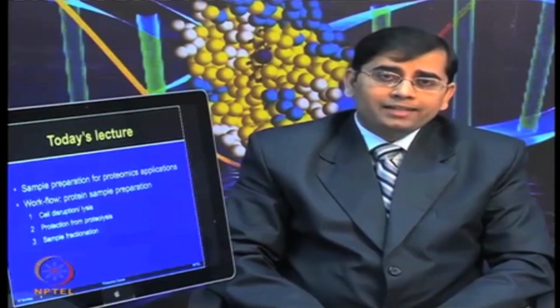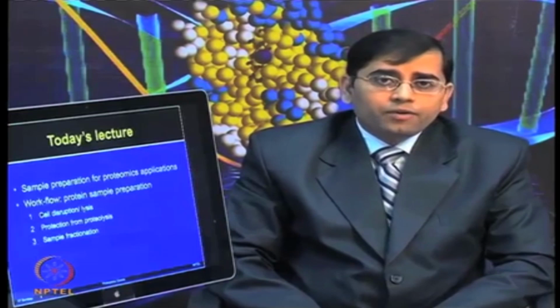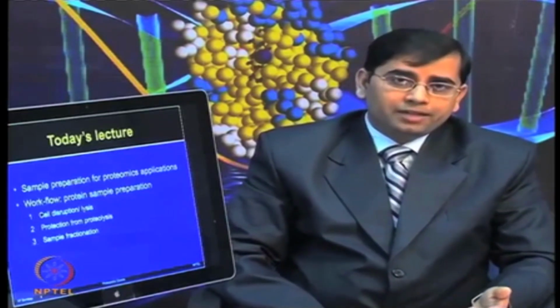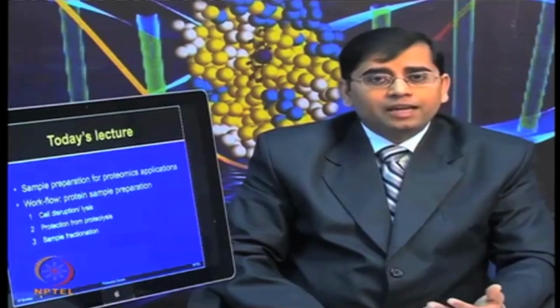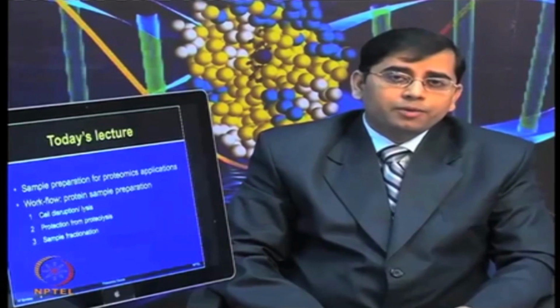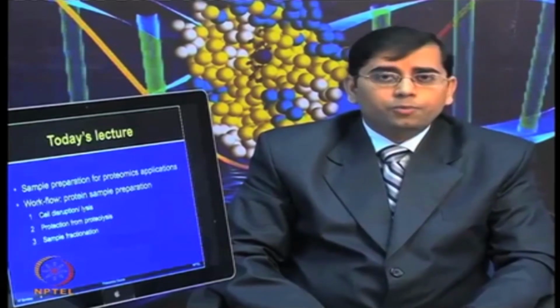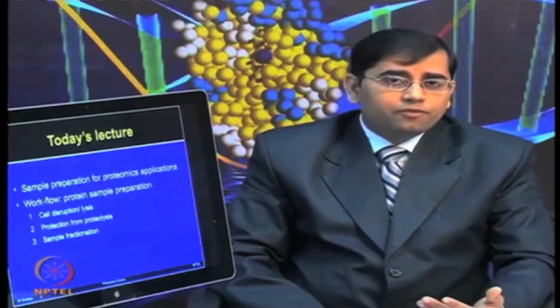But sample solubilization and some other components are added more when you are performing gel based proteomics. So, during this lecture, I will talk to you about different components which are essential to make a good sample preparation for proteomic applications. I will give you a stepwise workflow.